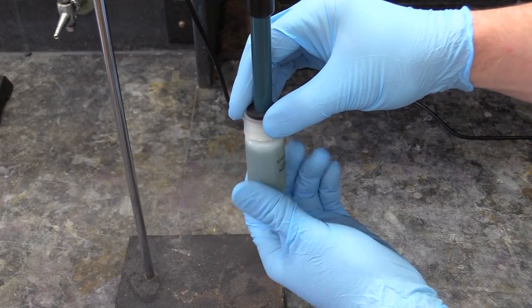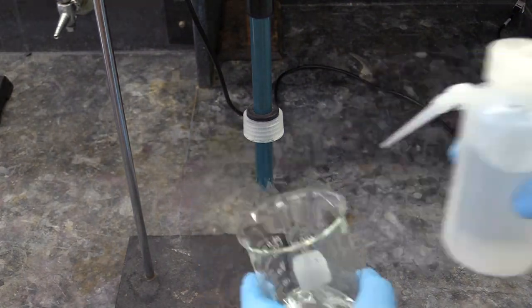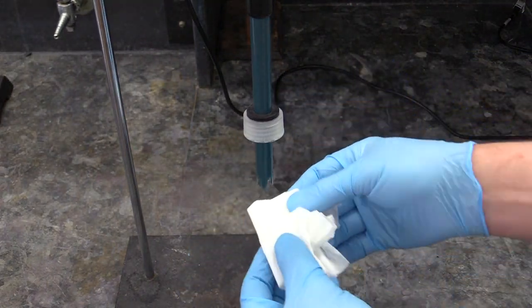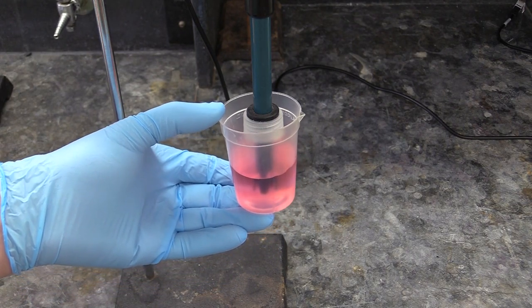After you've done that, unscrew the storage solution bottle from your probe, rinse it off with some DI water, use a chem wipe to get the excess water off it, and immerse the probe's tip into the red pH 4 calibration solution.